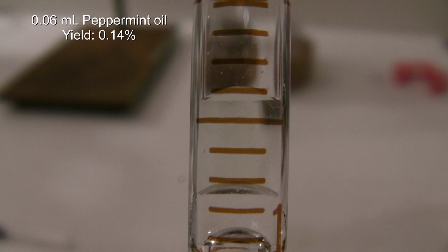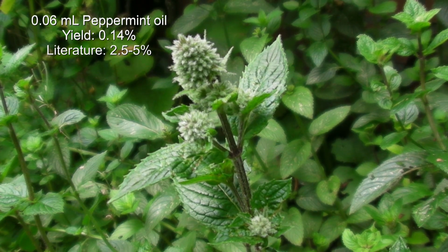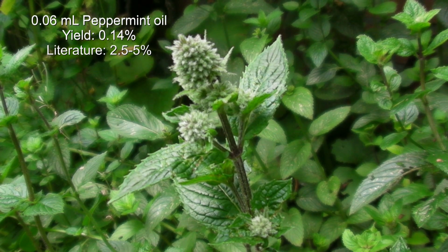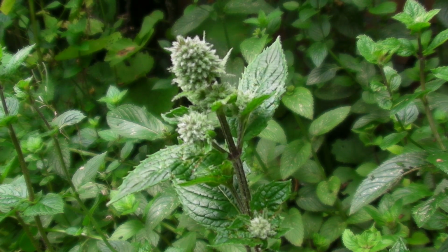The oil content depends on the plant and harvest time and is between 2.5 and 5% according to the literature. That's why it can be assumed that the peppermint had to be distilled way longer. I will show a more effective variation of the steam distillation in another video. This was a steam distillation of peppermint.